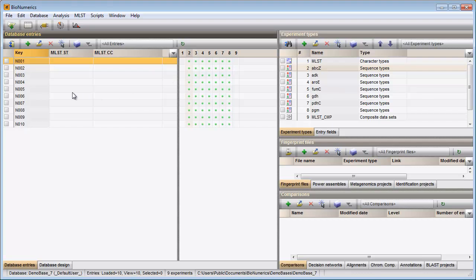After clean-up of the assemblies, the consensus sequences can be screened against the online or locally stored allele information.